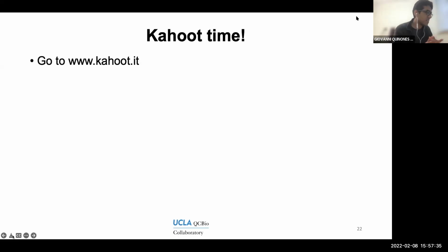Yeah, so after the little review of the material, I thought it would be good to actually look at the data, actually look at the output you get from the sequencer. And so you get an idea of what we're working with.